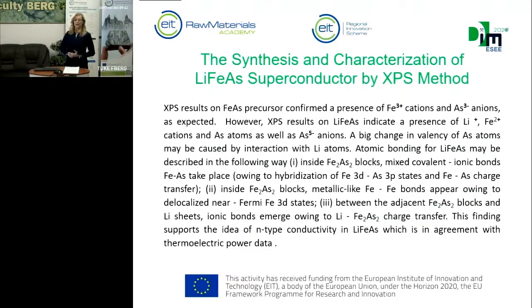By the XPS method, we confirmed a presence of iron in oxidation state 3+, and we confirmed the presence of arsenic anions with the oxidation state 3-, and we confirmed that this superconductor is a conductor with the N-type conductivity.